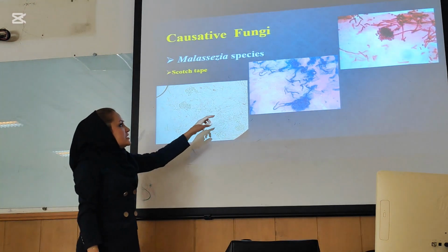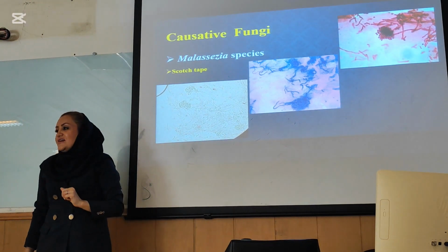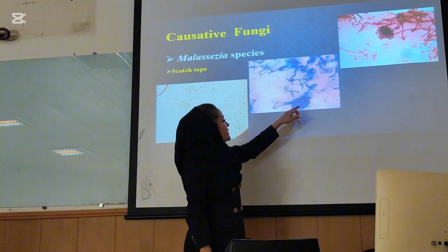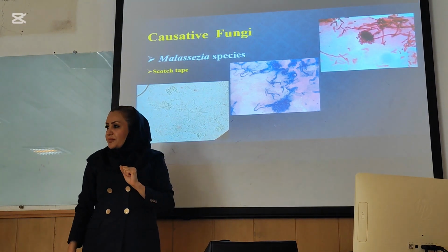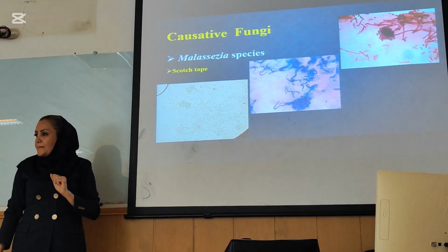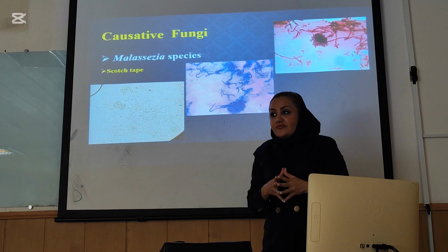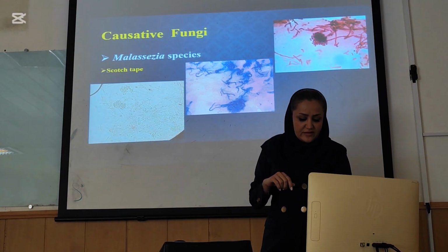Generally, this view is called spaghetti and meatballs, and this view is very special for the diagnosis of Malassezia in pityriasis versicolor.